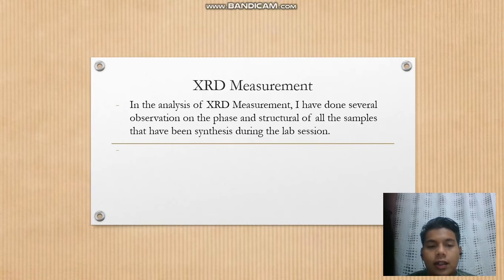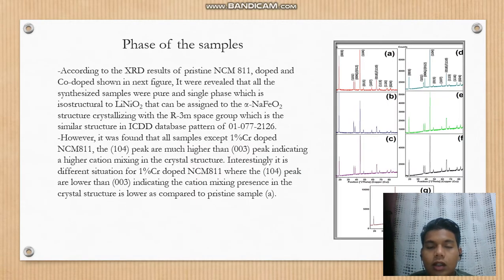So in the analysis of XRD measurement, I have done several observations on the phase and structure of all the samples that have been synthesized during the lab session. So number one is the observation on the phase of the sample.